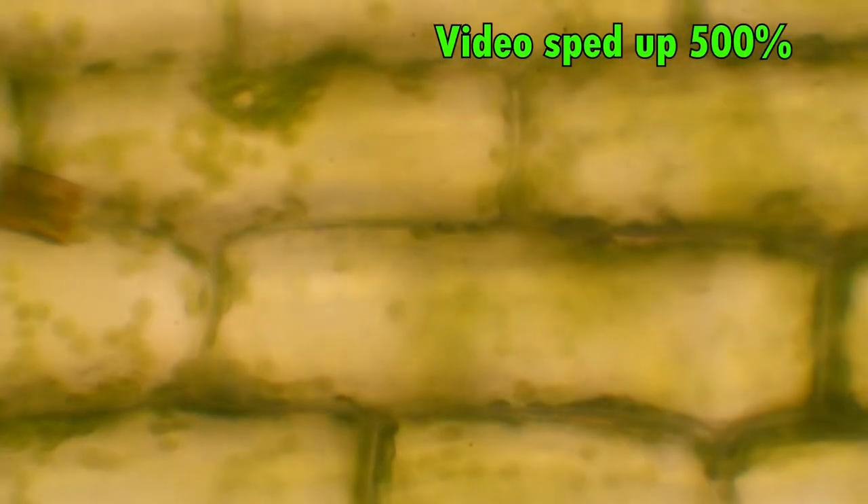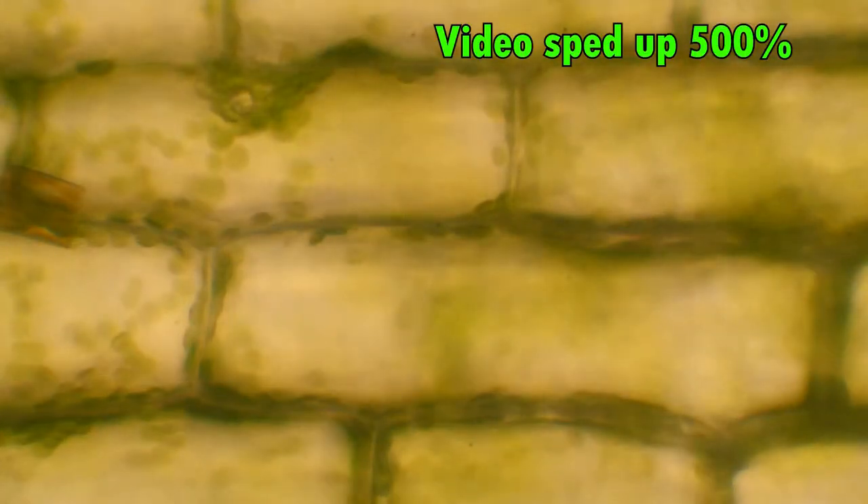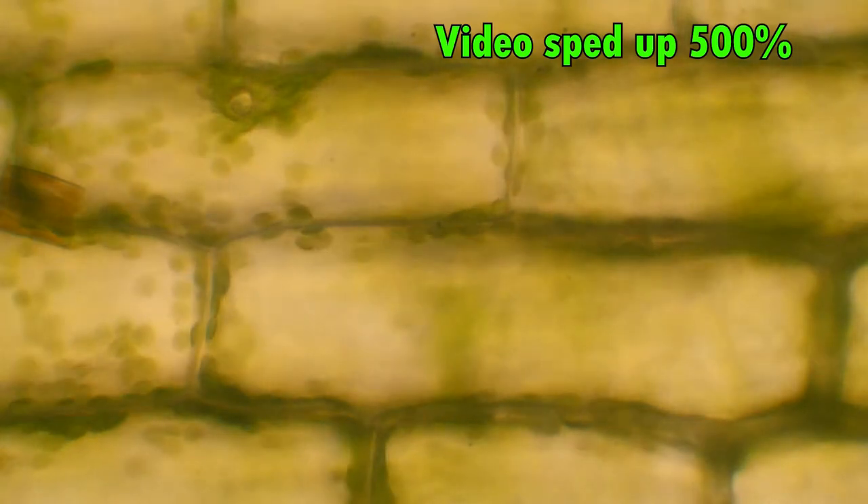The chloroplasts are floating around in a watery fluid called cytoplasm. Now, to understand what happens next, you have to know that freshwater organisms — like this plant and you — have cytoplasm with very little salt in it. Are you ready to see what happens when we expose this leaf to salt water?